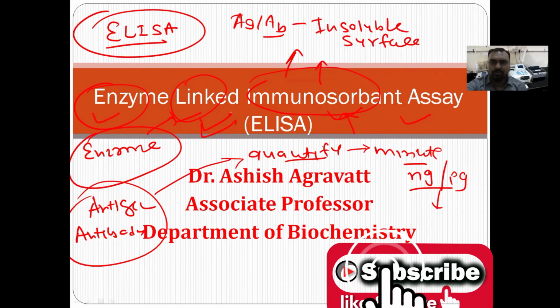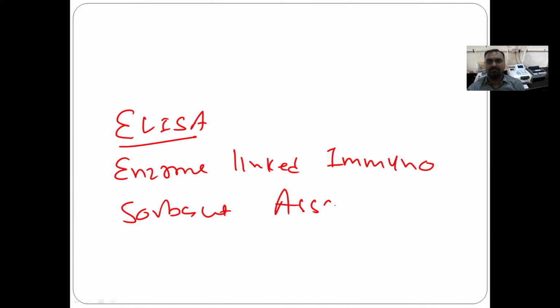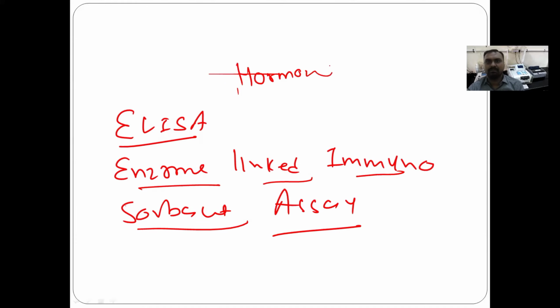So ELISA, what is the full form? Enzyme linked immunosorbent assay, which is very helpful to quantify substances in nanogram or picogram concentrations, like hormones and tumor markers.